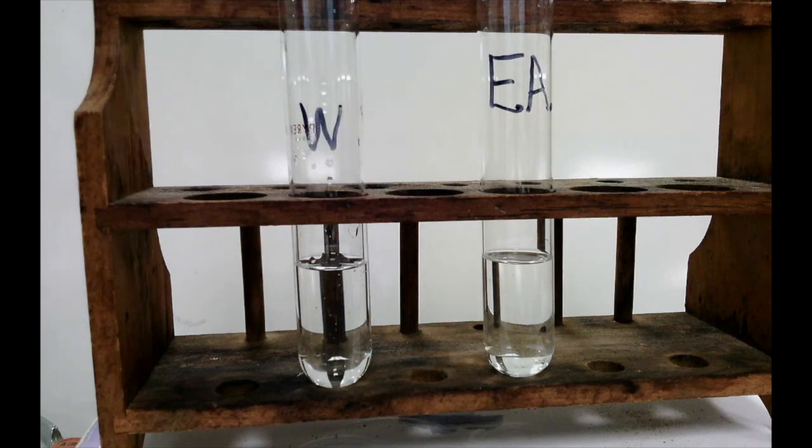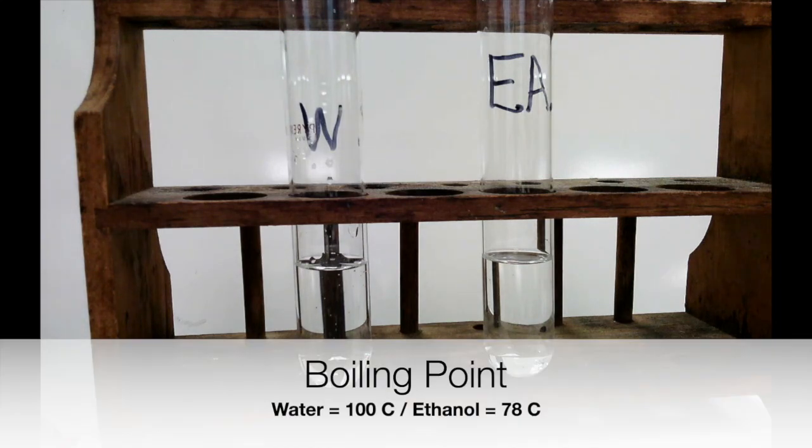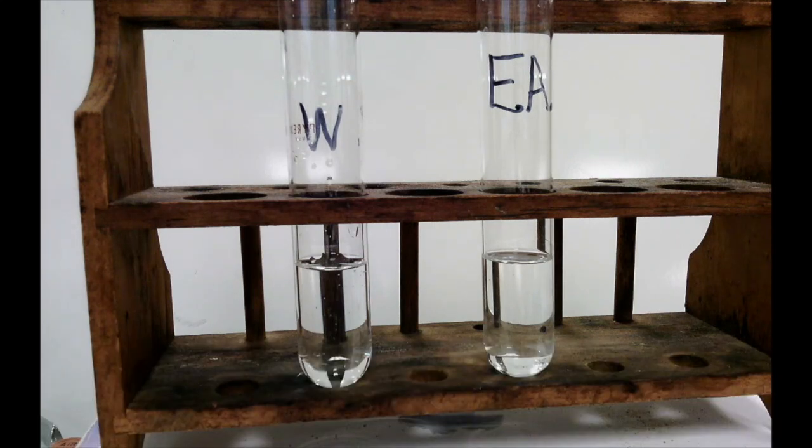The boiling point of water is 100 degrees Celsius, while the boiling point of ethyl alcohol is only 78 degrees Celsius. The last property on our list is solubility. Solubility is just basically how good is a liquid at dissolving something. And we're going to be testing the solubility of sugar in these two pure substances.